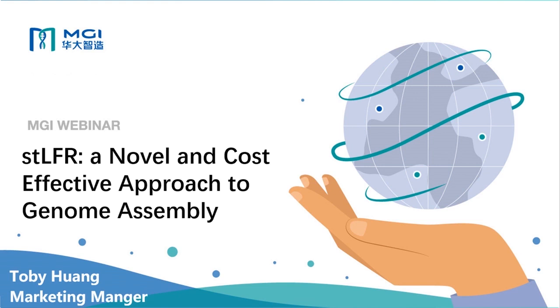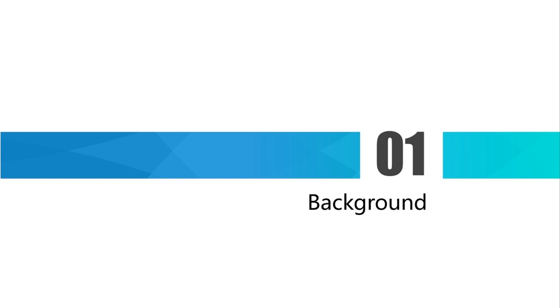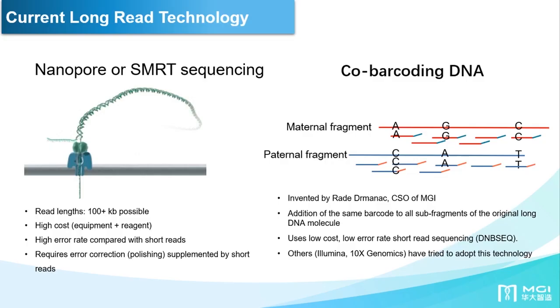So first, a little bit of background on the long read technology. On the left side, you can see that current sequencing technology involves nanopore or PacBio SMRT sequencing technology, which is basically reading very long fragments of DNA from the beginning to the end. Of course, the biggest advantage of doing this is you can read very long fragments, up to upwards of 100 KB. However, the downside is that generally these platforms have a very high cost, both for the equipment and the reagent, as well as a much higher error rate when compared with the traditional short read sequencing.